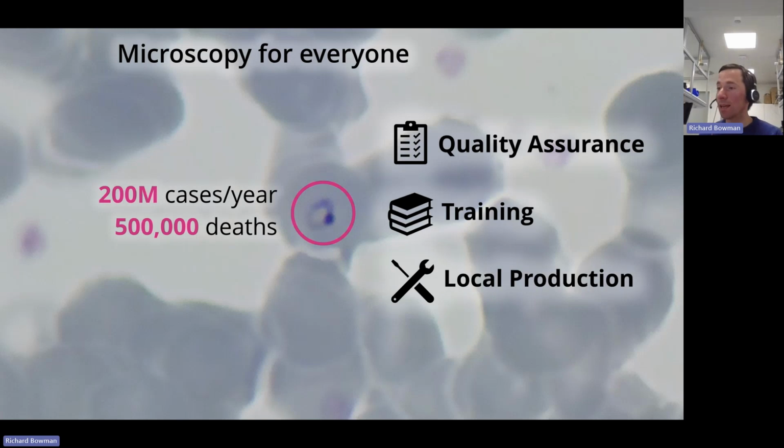And lastly, and I think this is the most exciting thing, the OpenFlexure microscope is something that can be produced locally. And so our engineering partners and our healthcare partners in various countries in Africa, especially Tanzania, are able to make a relatively sophisticated modern microscope without relying on unreliable supply chains and expensive imports.